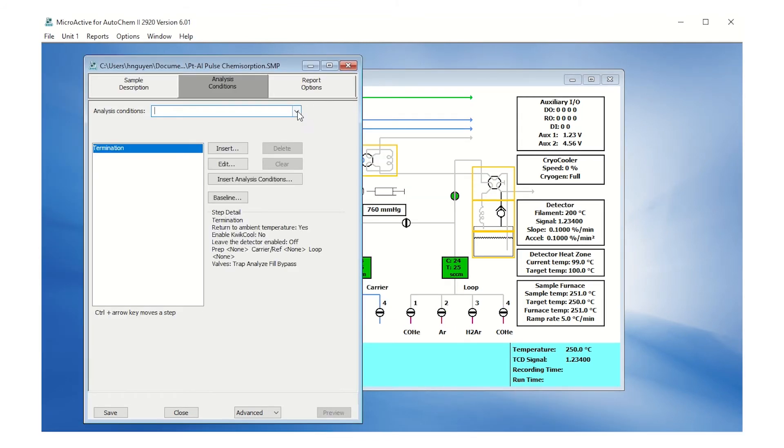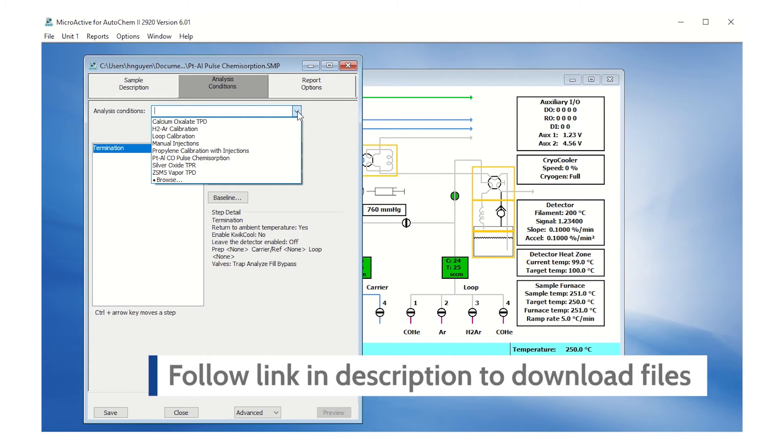Under the Analysis Conditions tab, select the drop-down box to access preset analysis conditions. An updated analysis condition for CO pulse chemisorption on platinum alumina is in the link provided on the video description below.